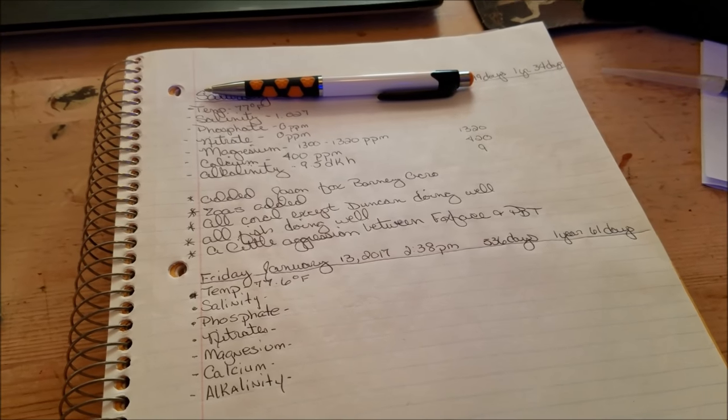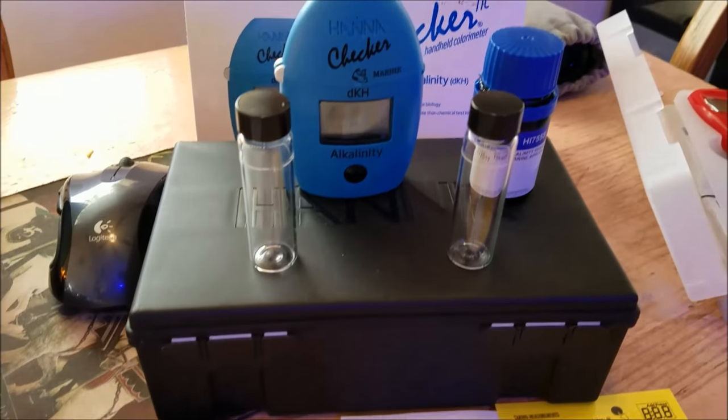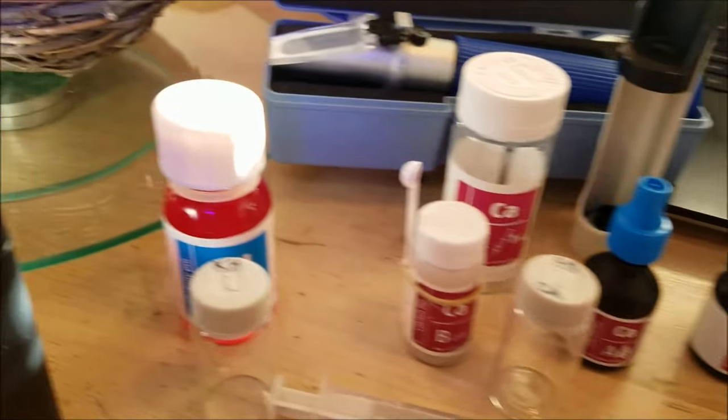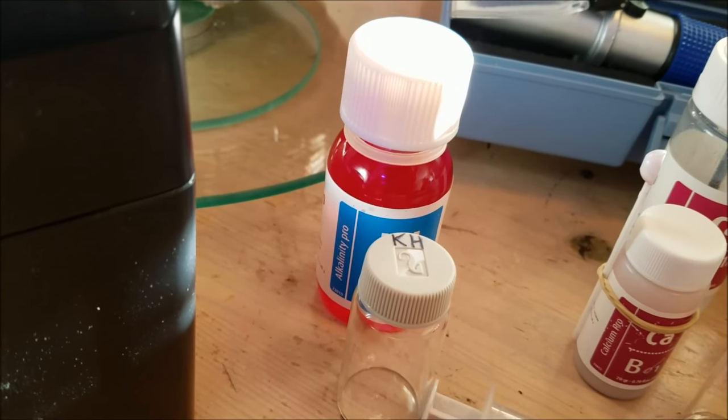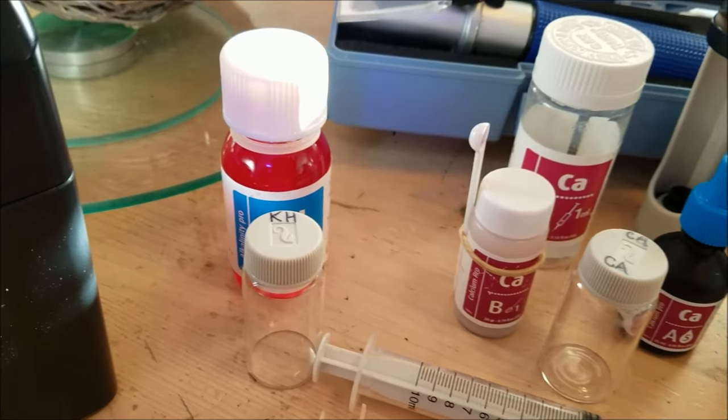So today we're talking about testing — in particular, comparing the Hanna Checker Alkalinity with the Red Sea Alkalinity tests, just to see if they pair up or whether we come out with totally different numbers.